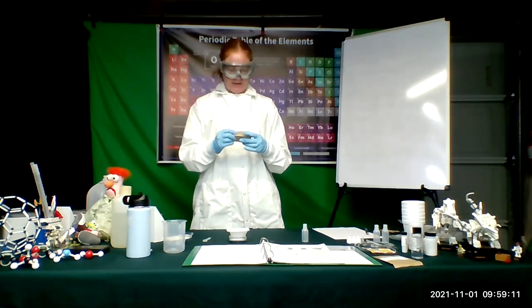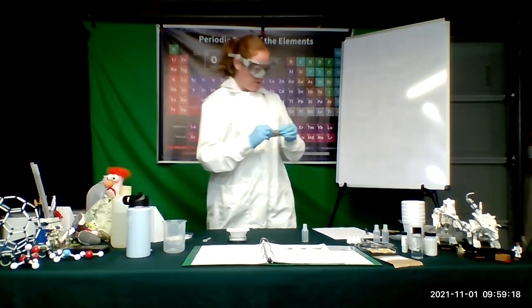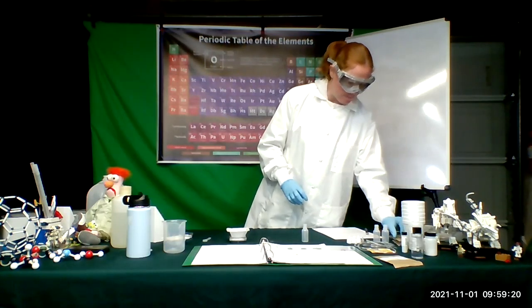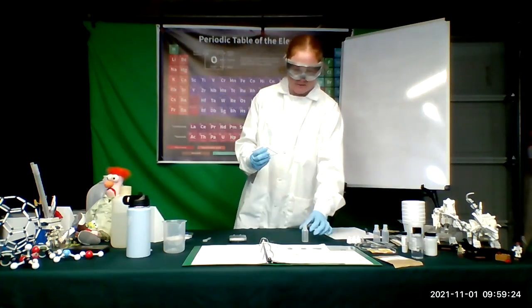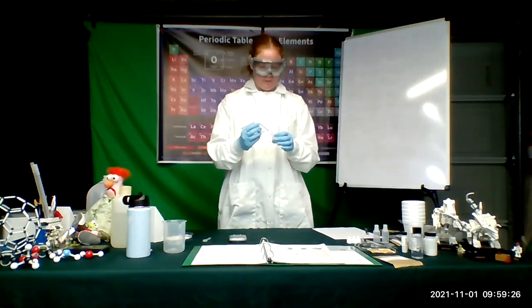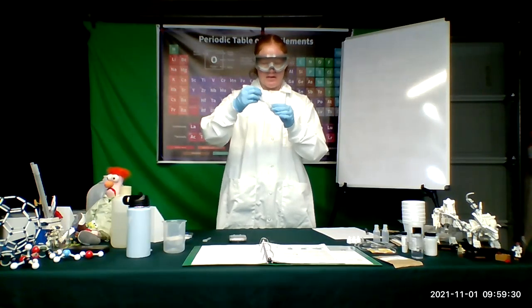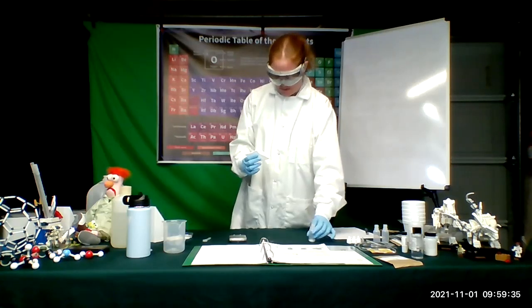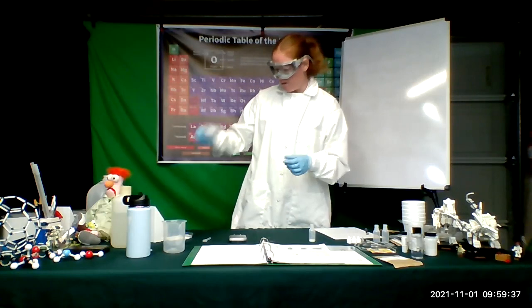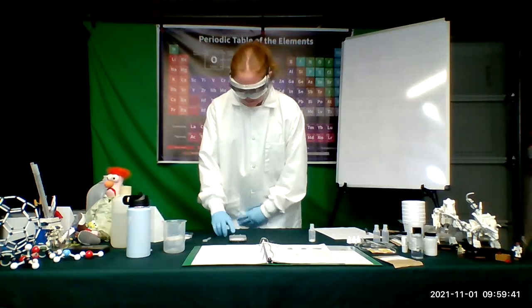I do need my sucrose later, so I'm going to carefully fold my envelope around so that it doesn't go spilling out. I'm going to put that off to the side to use later. Now I need to add my sucrose to my small bottle. The nice thing about these weigh boats is I'm going to pinch it in half and it becomes a little funnel. And now this one's been used for sucrose, so I'm going to put it off to the side.